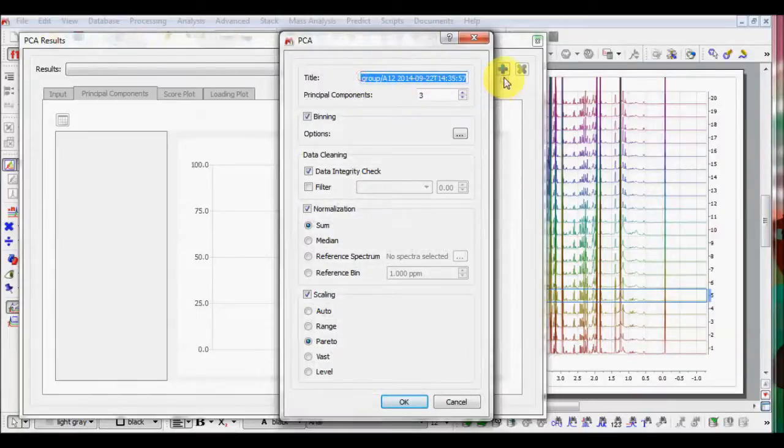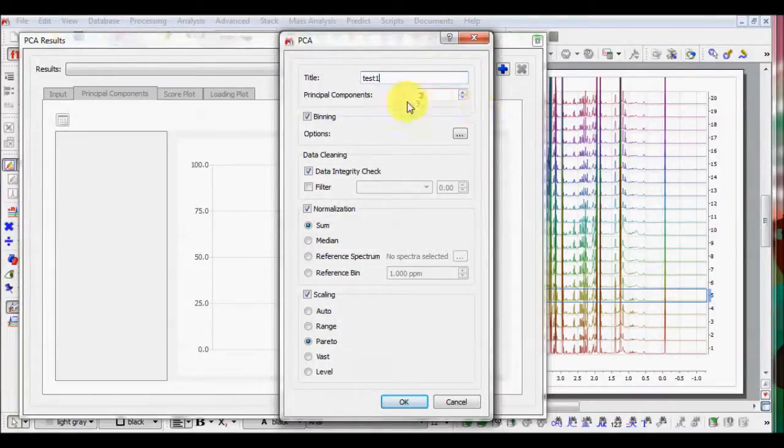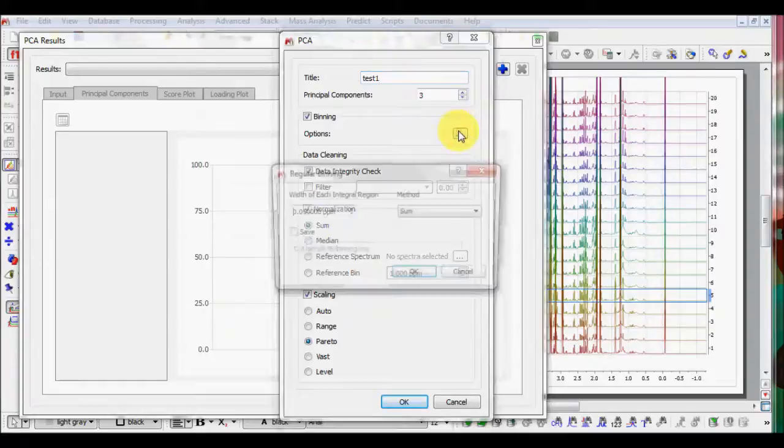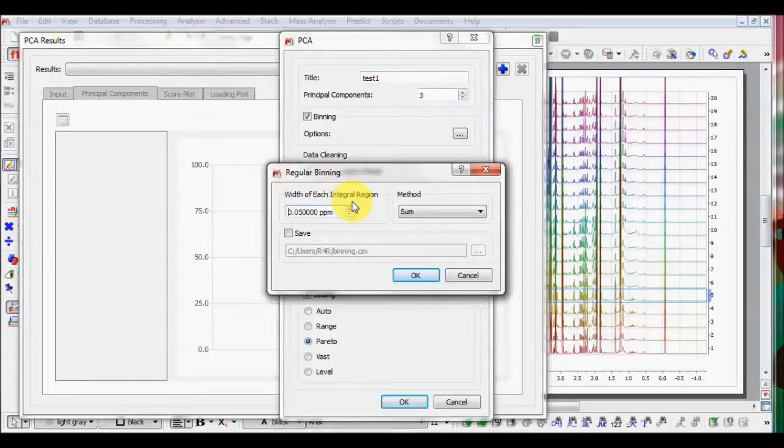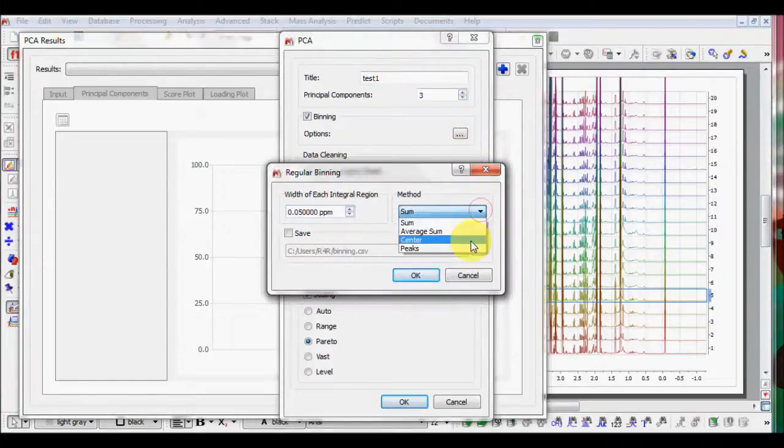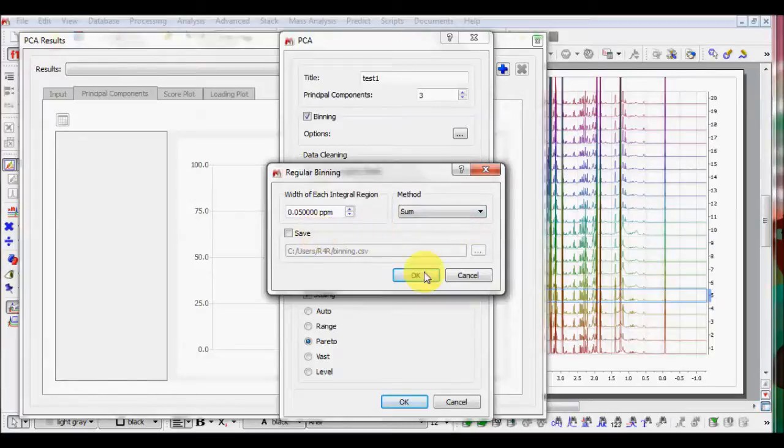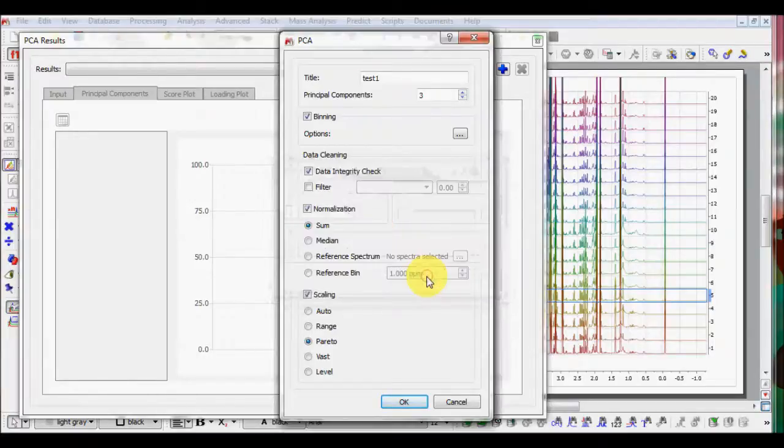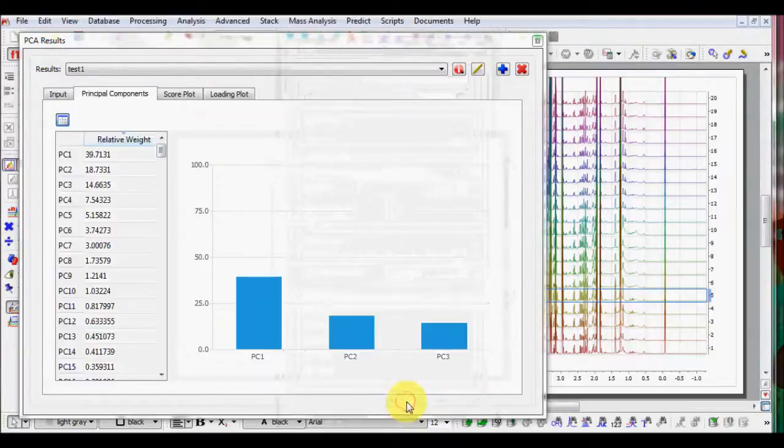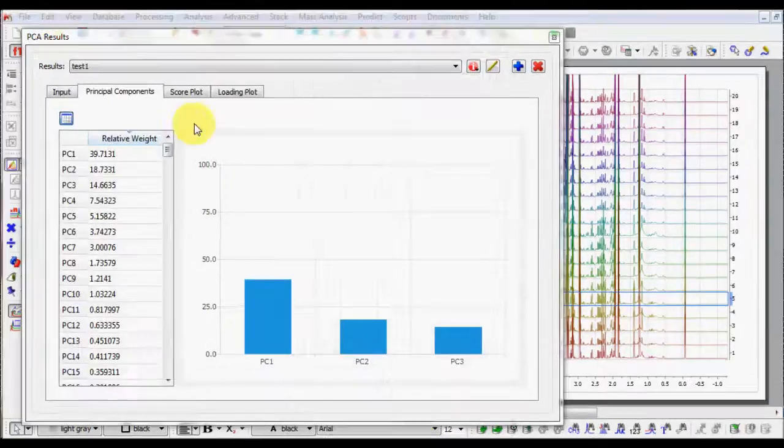You can customize analysis title as well as several parameters such as bin width, binning methods, data cleaning, filtering, normalization and scaling. And you can save the matrix as CSV file.